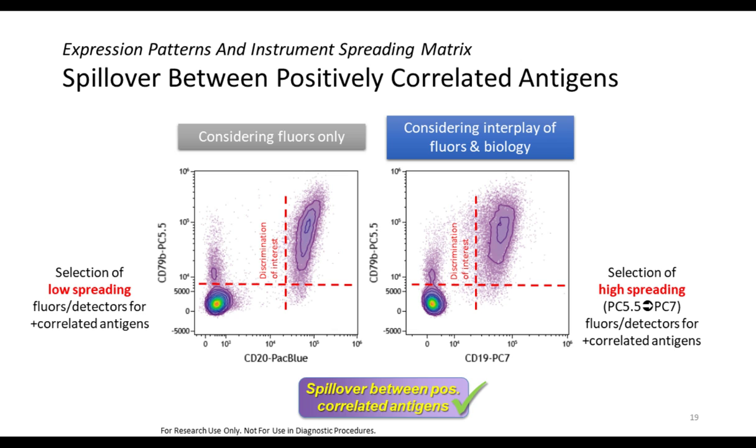And because here we again have made use of the biology, we know that those two antigens, just very similar like on the left, always occur together on the same cell surface. The only differences that we may see between cells and between certain samples is that expression densities may be modulated.